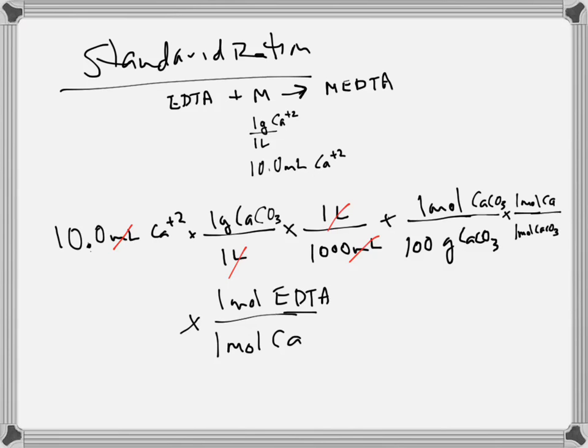The whole goal of this was to do what, though? Standardize what? Calcium. No. Concentration. What are the units on concentration?